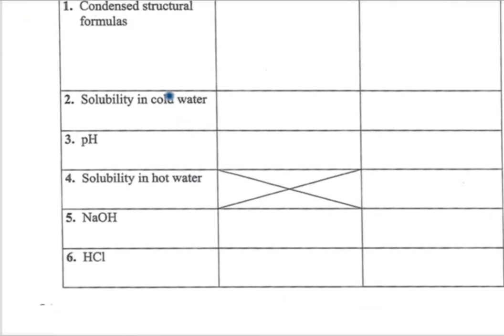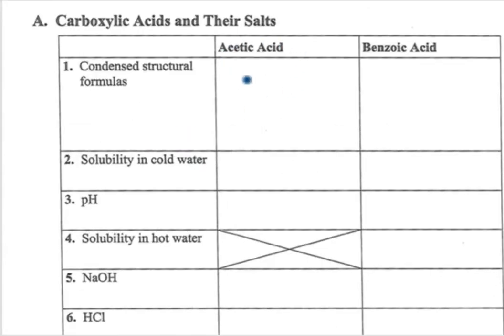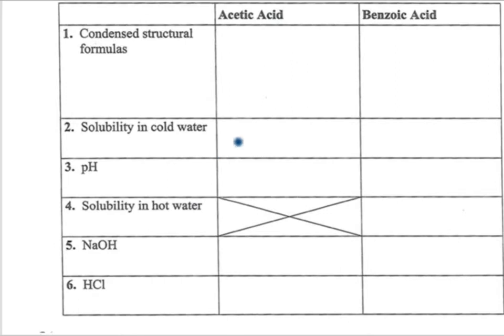When you're watching the solubility portion of the video, remember that any degree of cloudiness indicates an insoluble solid. As in, since acetic acid is a liquid, then what you would be looking for is two phases. One of the sample being added and then one of the water.